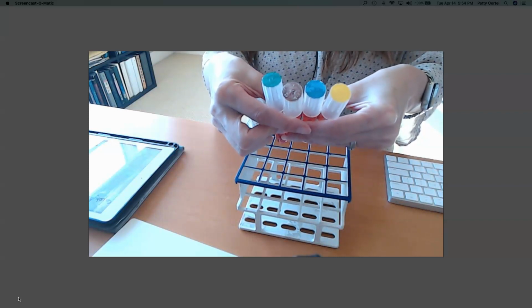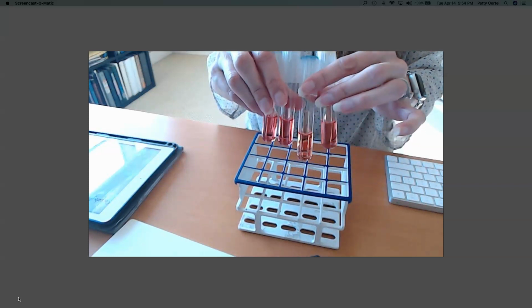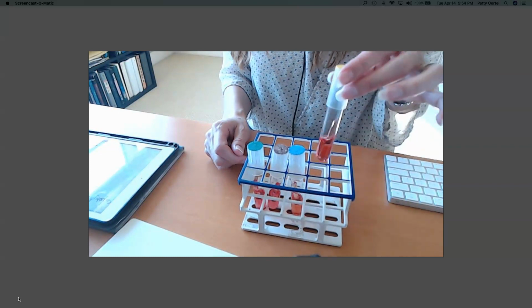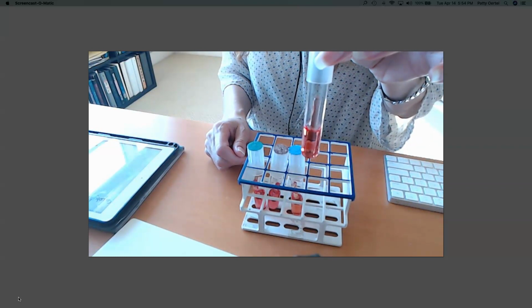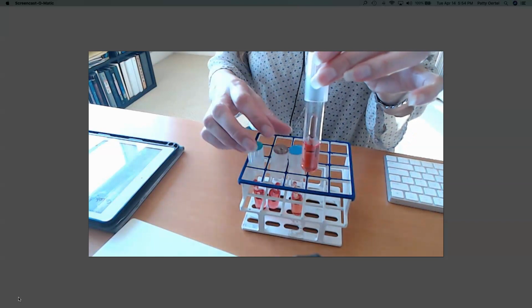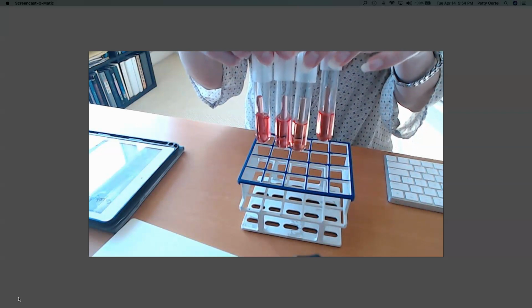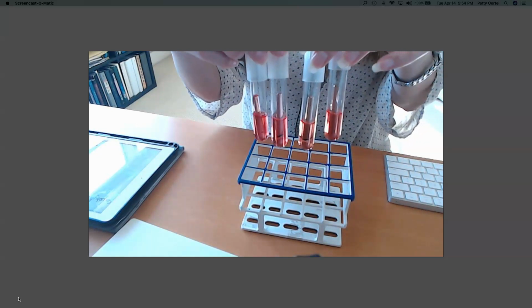Looking at my little chart, my little cheat sheet that you had in your community drawer, you can tell which sugar is which. What I want to show you actually is I want you to take a close look at this carbohydrate. What do you notice in all of these 4 different carbohydrates? The color, for one.